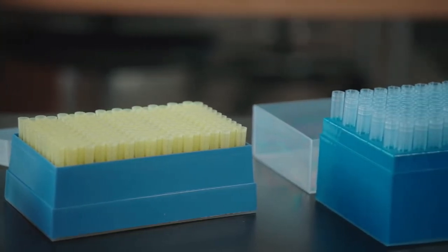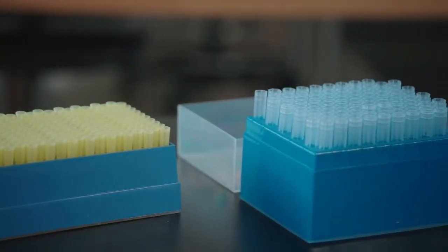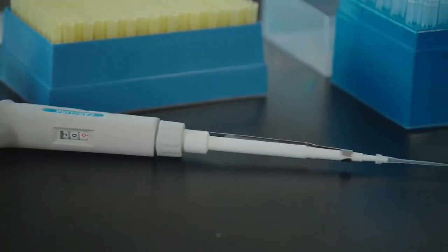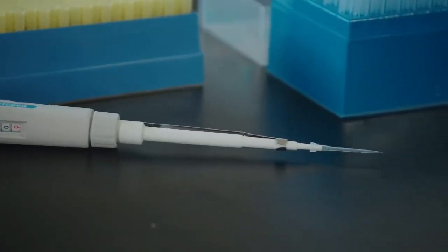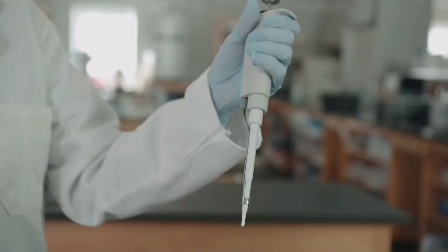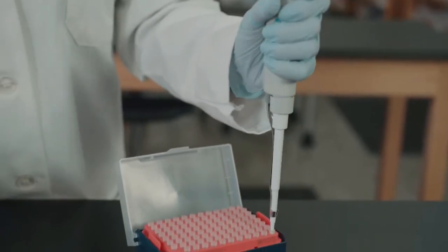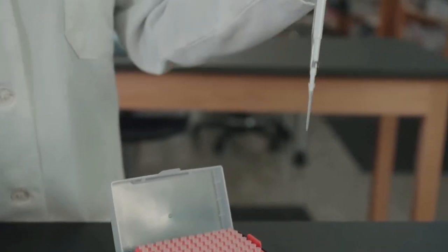In order to take up the indicated volume of fluid using the micropipette, you must first place a disposable plastic pipette tip onto the end of the pipette. Different types of tips are used with different micropipettes. This clear tip is used with this P20. To take liquid up into the pipette, first place the tip on the micropipette, as shown here. Make sure the tip is firmly seated on the end of the micropipette.